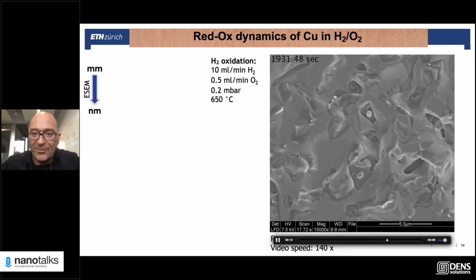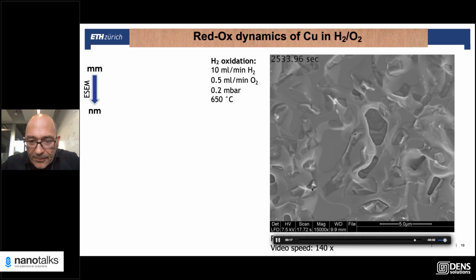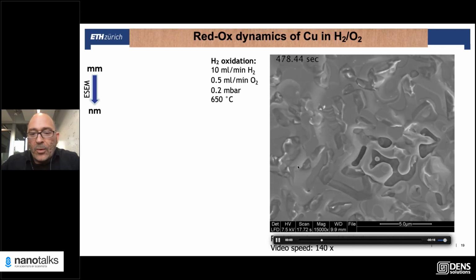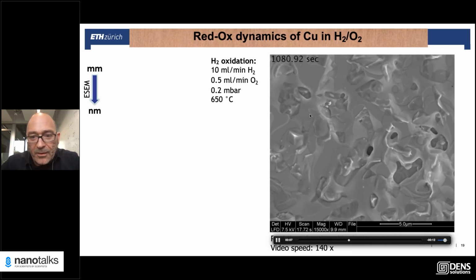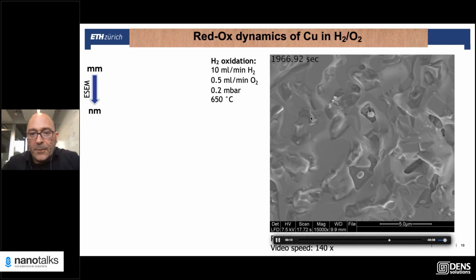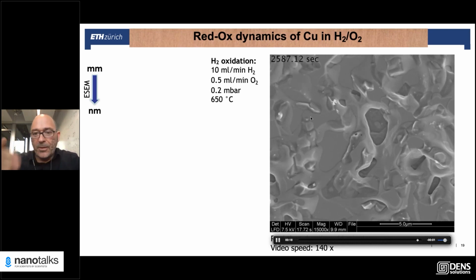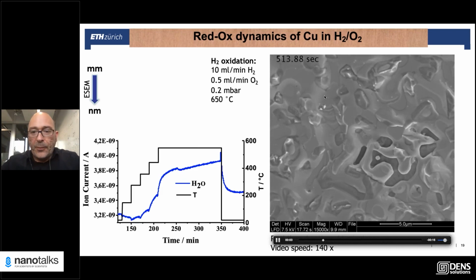And the beautiful thing in this video is you can look at the boundaries where oxide is reduced by hydrogen, and you know where water is forming. So you can look at the movie and you can tell water forms here, where the oxide island is getting eaten off. And we were, of course, wondering, is there some other place where catalytic water formation happens? Not just water formation from reduction of oxide, but maybe some water formation by some other catalytic mechanism. So first we needed to see, do we really form water?